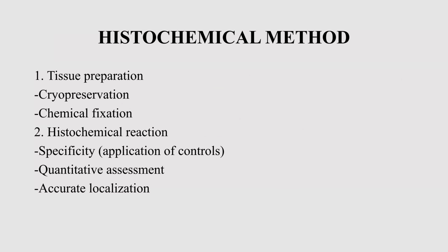For histochemistry, of course, we have some difference from typical histology. Histology is based on rough fixation into alcohols, into xylenes. It often leads to destroying fats or some complex chemicals, which are easy to destroy by xylene or strong alcohol.